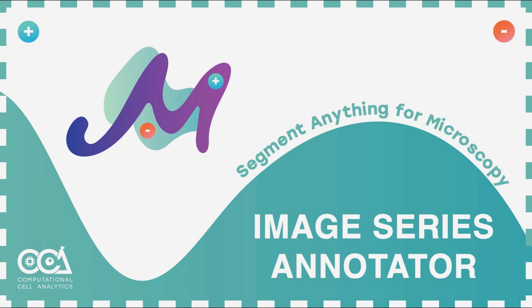Hello everyone, welcome to Microsam. In this video, we'll be learning about how to use the image series annotator for annotating a series of images.